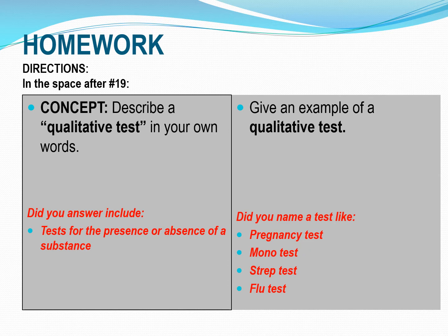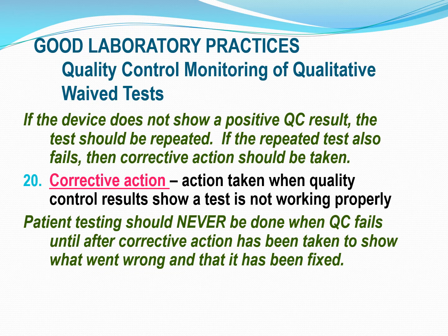So you want to make sure that in your concept one, your answer includes that it tests for the presence or absence of a substance, right? An example would be something like a pregnancy test, strep test, flu test, that kind of thing. So still on good laboratory practices, we're talking about quality control monitoring a qualitative waived test.